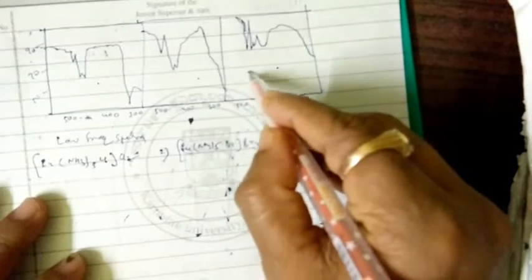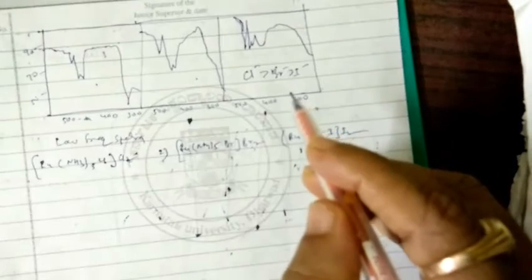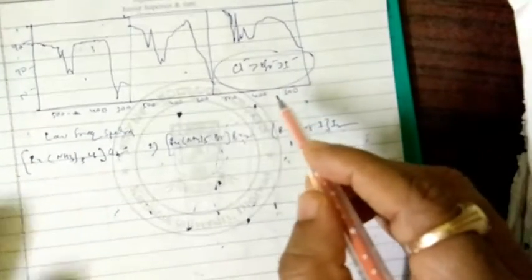Here also you can see the NH3 rocking vibrations in the ligand, and it's more sensitive, and the frequency of these vibrations decreases. So you can see chloride is greater than bromide is greater than iodide here; the frequency decreases. This is how the role of the halide is also very important here.